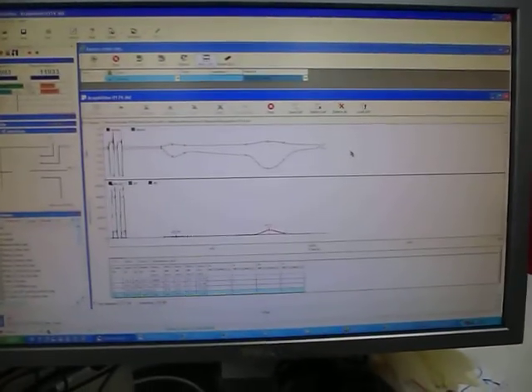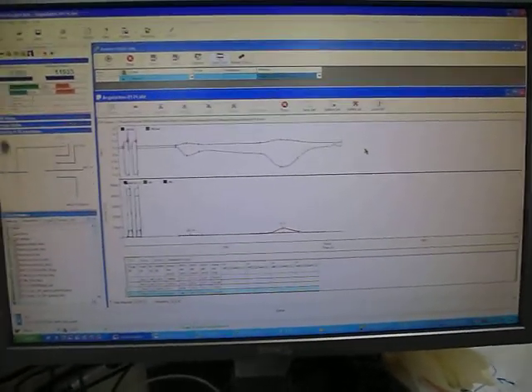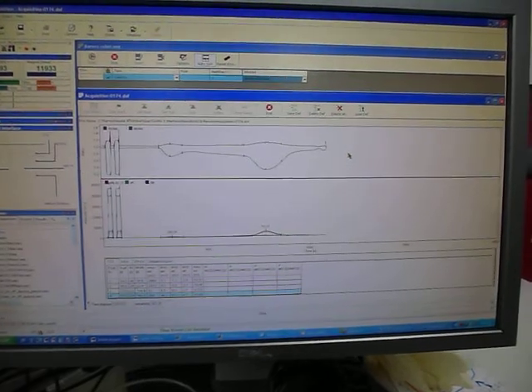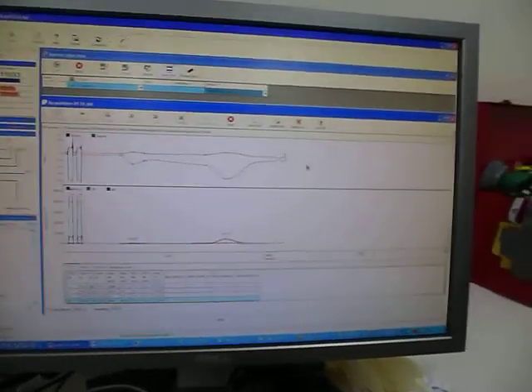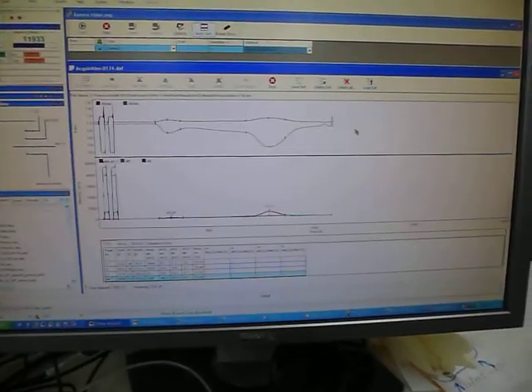This video is about a robotic arm being integrated with a TOC analyzer and isotope ratio mass spectrometer. This is the software showing the measurement of the sample by the isotope ratio mass spectrometer. So there are two peaks, very small ones. It's the end of the first sample. So in some time, the second sample will start.